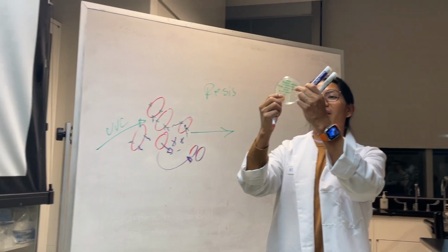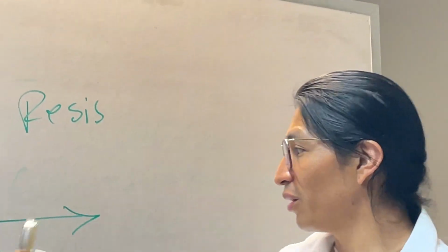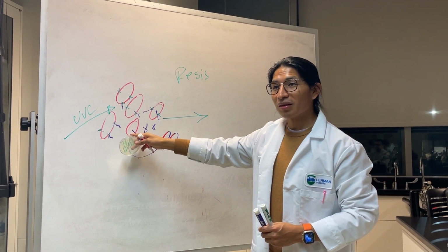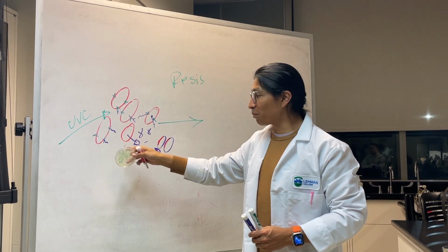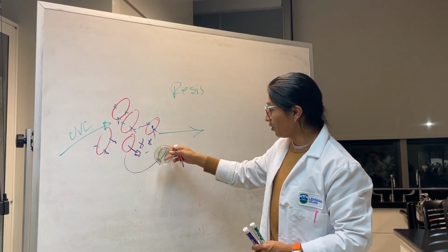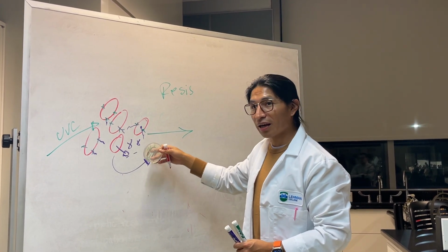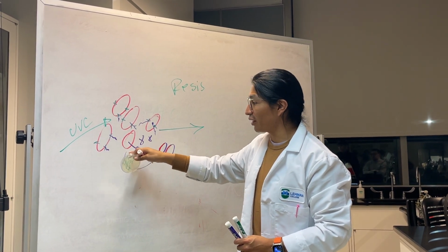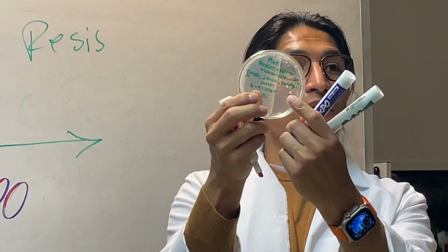And I can say this is where the colony is coming from, those little cells, a couple of little cells that were left over in there, that were able to incorporate little bits of DNA that was in the environment. And now as they divide, they might have incorporated bits of DNA that was released, and that is translated into these colonies.